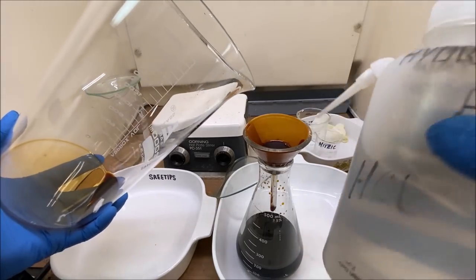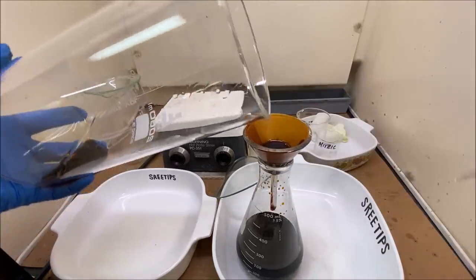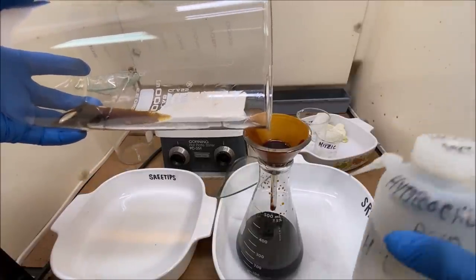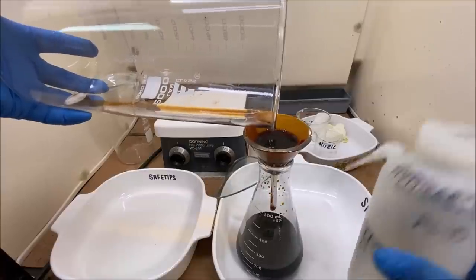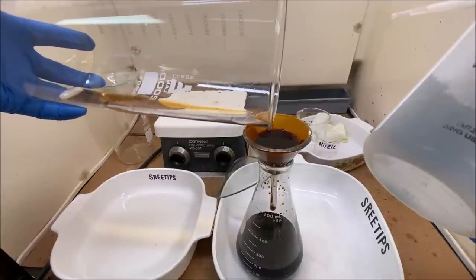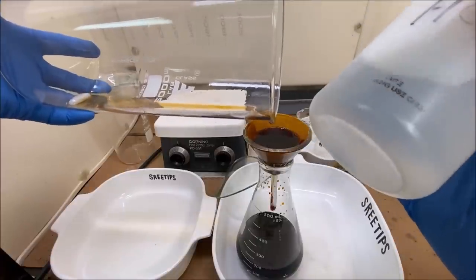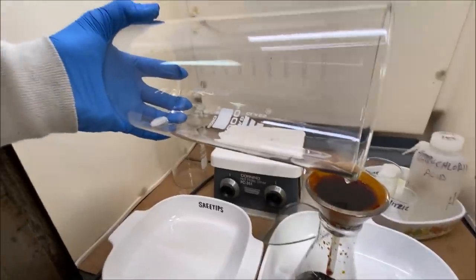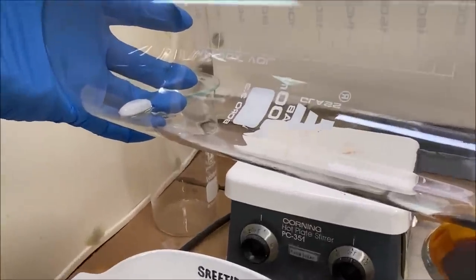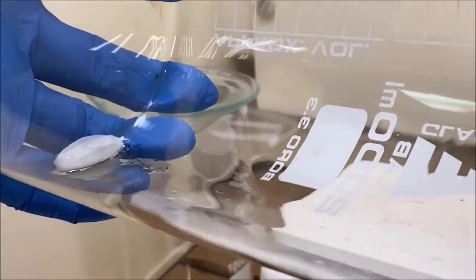And what we're going to do is I've got some hydrochloric acid in the squirt bottle. We're going to rinse our beaker out with the hydrochloric acid. Pretty much got just about all of the platinum to go in solution. Just a few little bitty pieces left up here. There's a look at the residual platinum that was left in our beaker. It's not much, just a few little flakes.